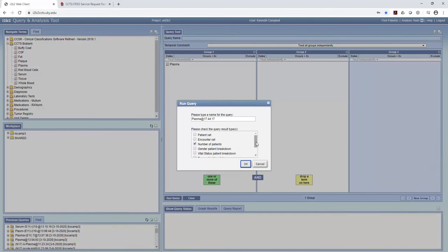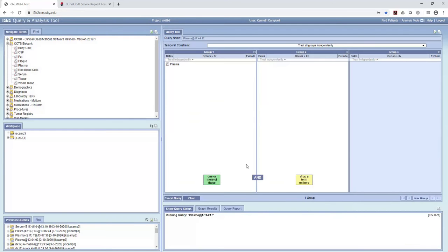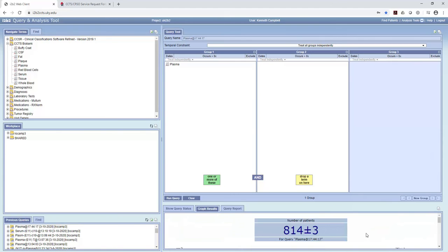And then I can go run query. So I've got a variety of options here on run query. But for example, let's click the gender patient breakdown race and age. And I go okay. And what I'm doing here is I'm searching the electronic information for the University of Kentucky. And I'm seeing how many patients are there in our system that the CCTS biospecimen core has a plasma sample from. And typically, these results take, you know, 5 to 10 to maybe 30 seconds. It's a little hard to predict, but it's not minutes.